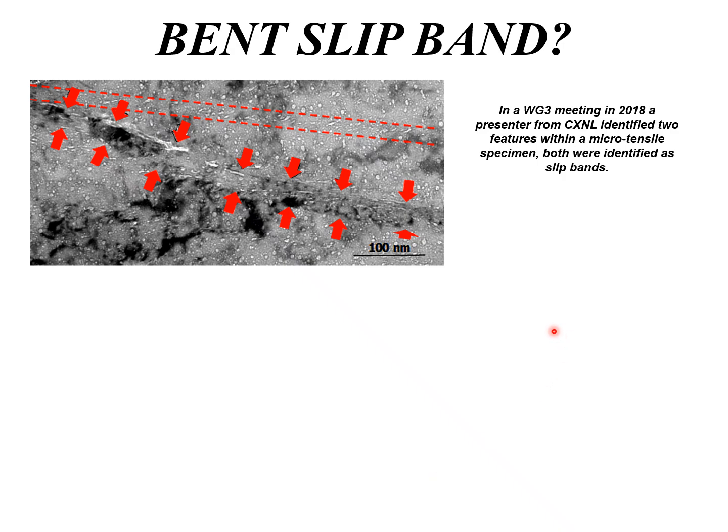Touching on the other thing I was talking about, identifying this band as a slip band. Here's that same feature where there was cracking further down into the foil. And one of the other things I pointed out was, well, it's bent. And I got so many excuses from people bending over backwards, forgive the pun, to say why a slip band could be bent. And I've seen that kind of nonsense in many cases.